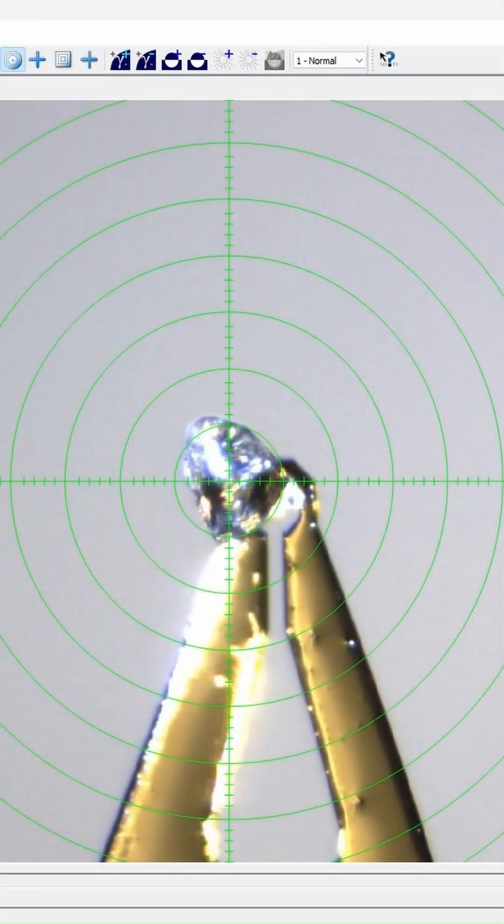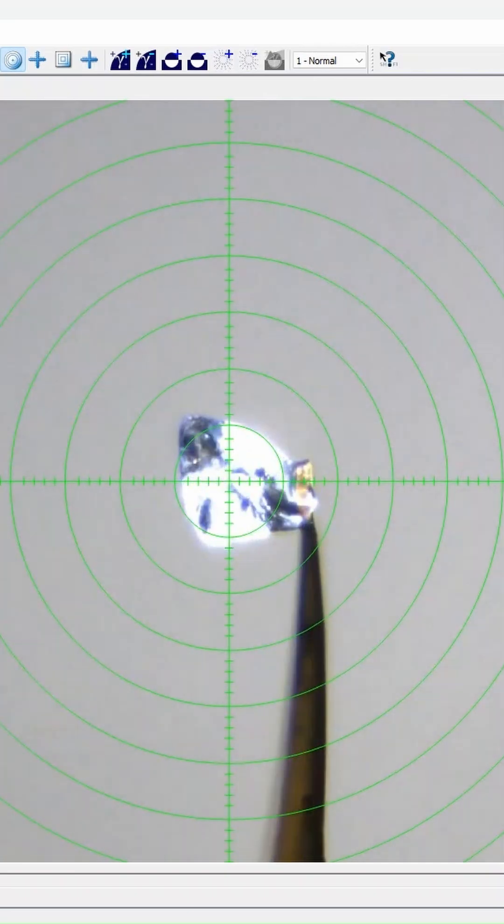Mount that crystal onto your goniometer head and open the Center Crystal plug-in. Take your goniometer key and move your crystal up and down and left and right until it's in the center of those crosshairs. Now move it 90 degrees and you'll be able to see the other axis — center this one as well. Continue to change your crystal orientation until you have that crystal in the center of the crosshairs every time you turn.